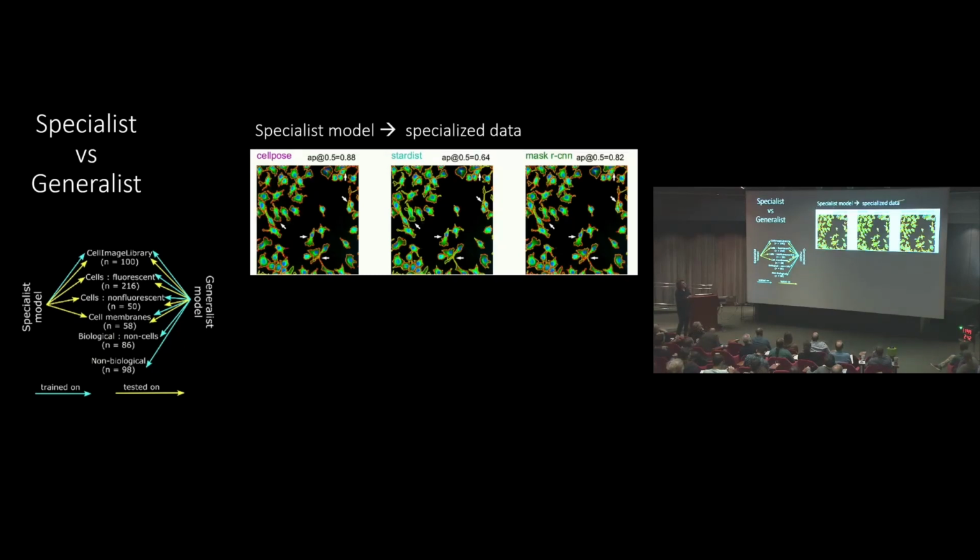We also compare a few different approaches to do the segmentation problem itself. So what I have described to you is the Cellpose approach, with the masks and the pixels going towards the center. There have been at least two recent state-of-the-art approaches for doing this. One of them comes from the computer vision community, and this one comes more from the image analysis community.